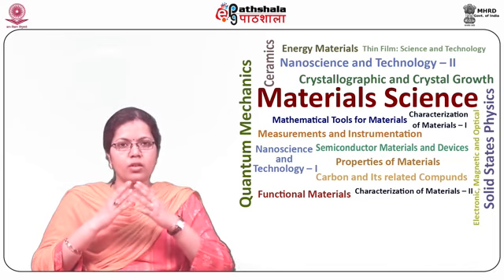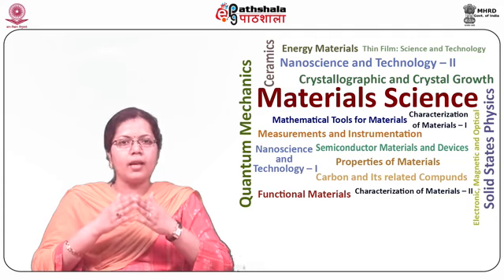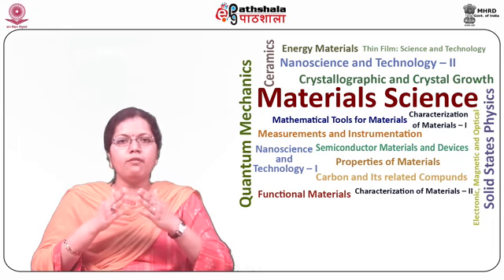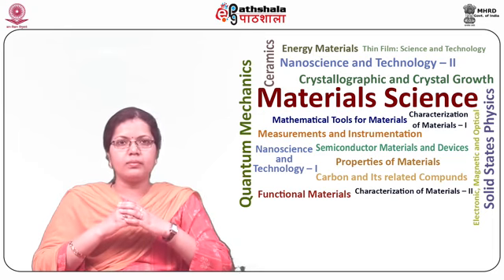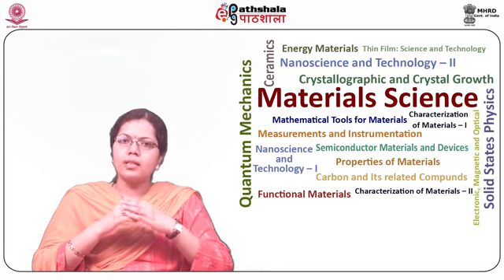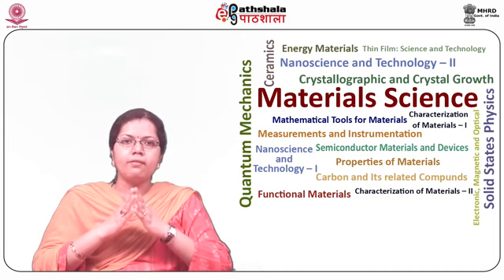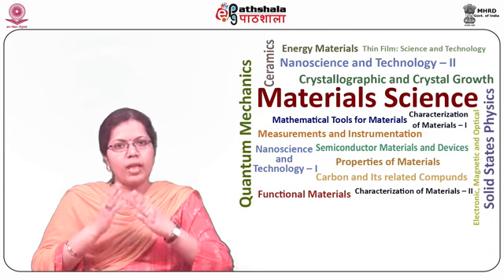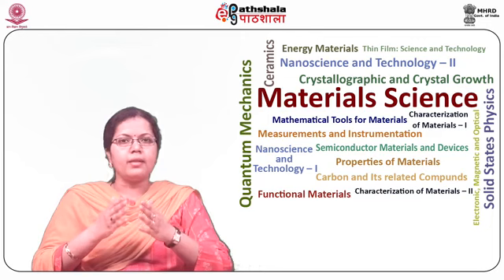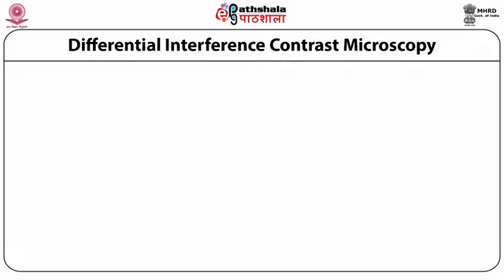Investigations involving crystallography, mineralogy, and polymer morphology can also be carried out by phase contrast technique. Colorless microcrystals, powders, particulate, solids, and crystalline polymers with slightly different refractive index from that of the surrounding immersion liquid can be readily detected by this technique.